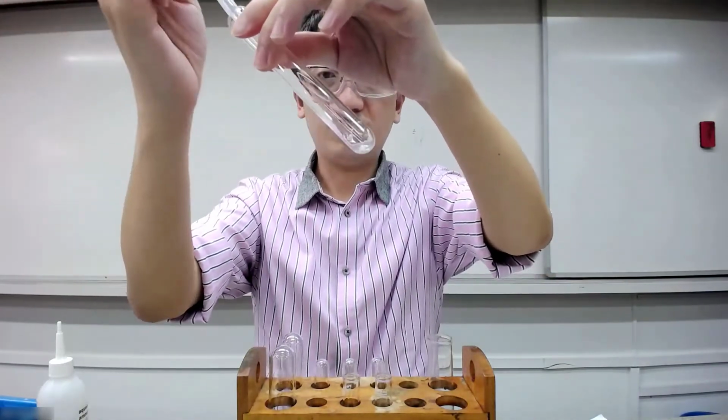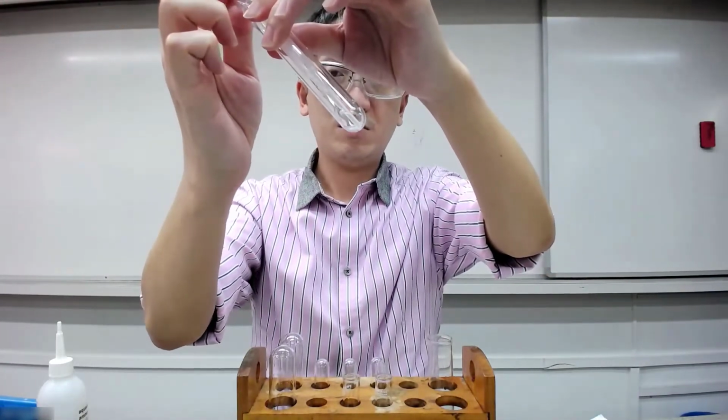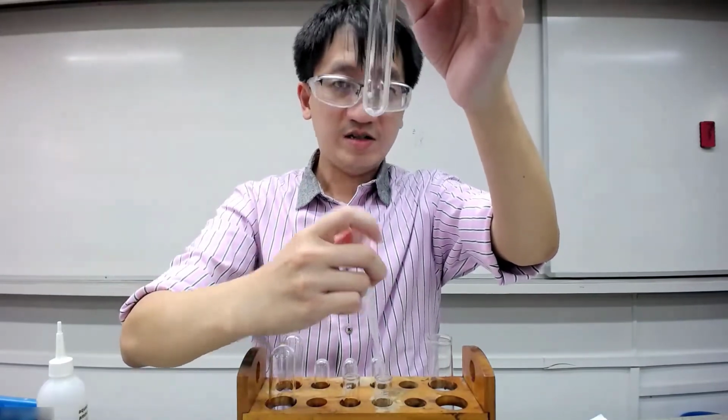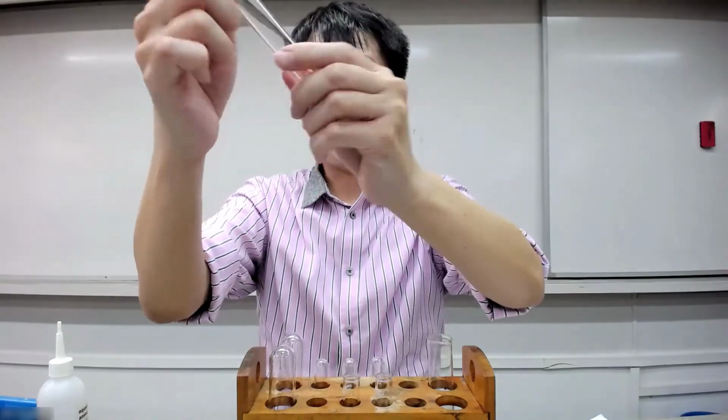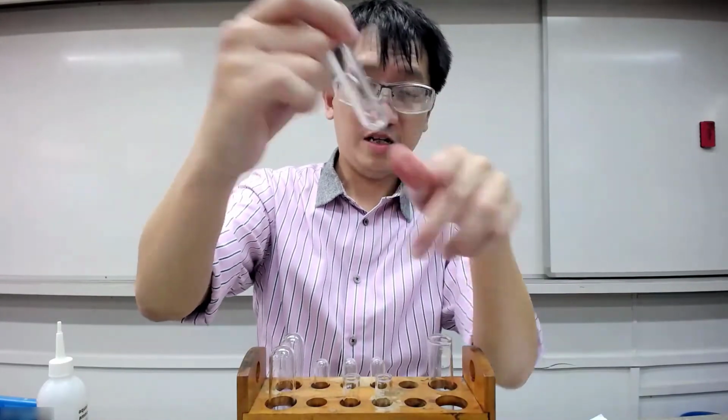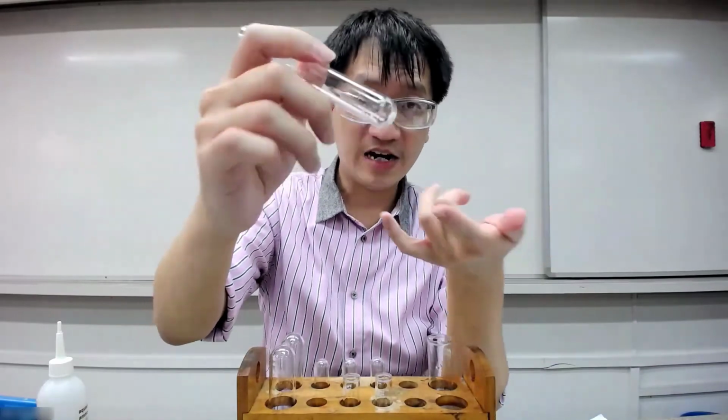Just going to again use the dropper to remove the liquid. Okay, so that should be good enough. So this is the washed PPT. It need not be completely dry. I think this is fine.